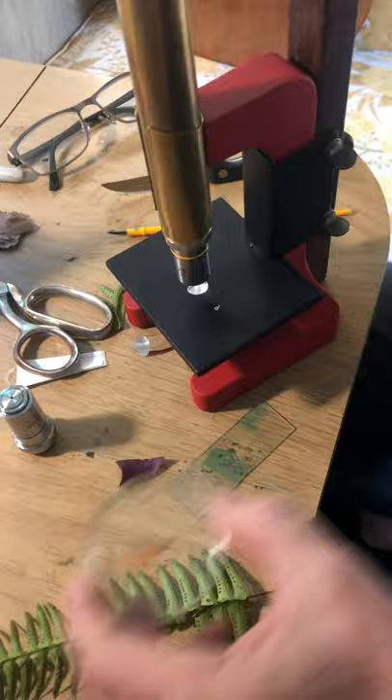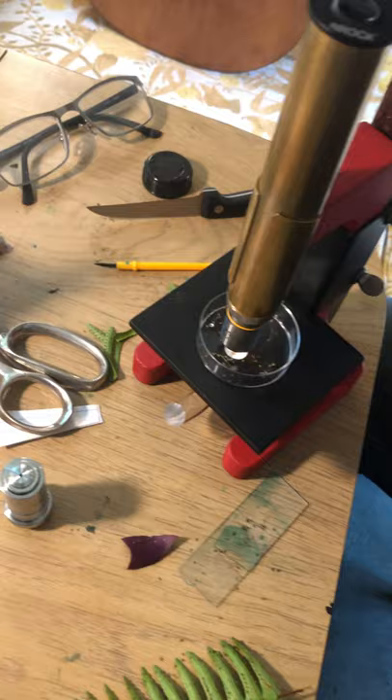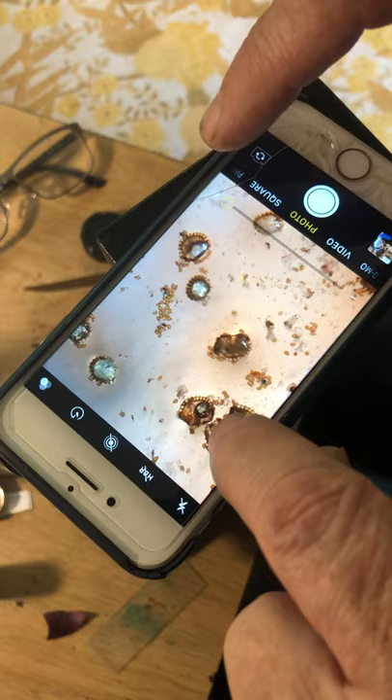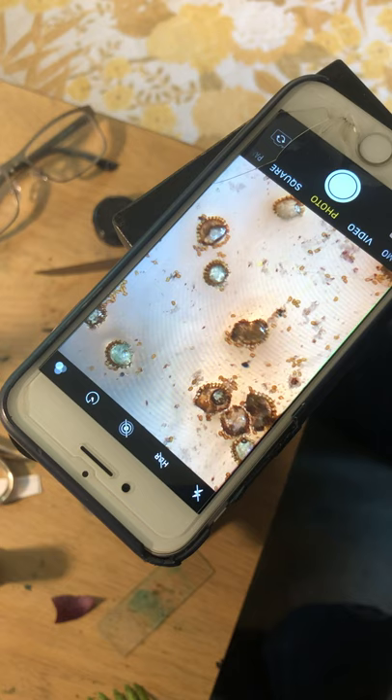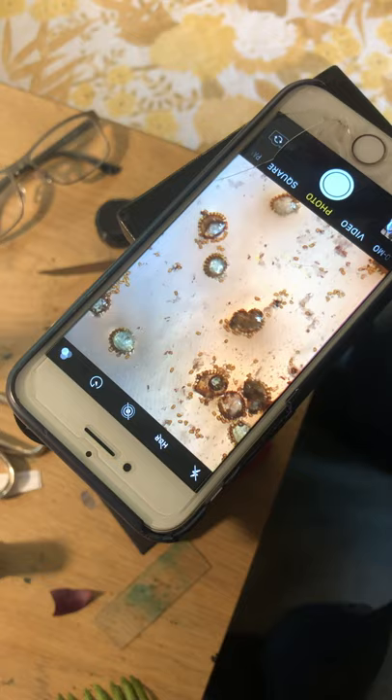I could have left it on a petri dish and still would have seen what you see there. I have some here — this is just debris. Let me move my eye over it and get it in focus. You can see there's a lot going on, a lot of activity, a lot of swirling because the alcohol causes that — the evaporating alcohol causes that. Those are basically spores just pouring through there on the turbulence created by the evaporating alcohol.